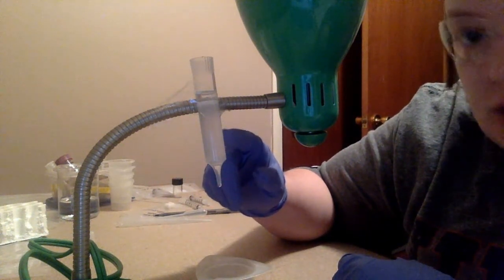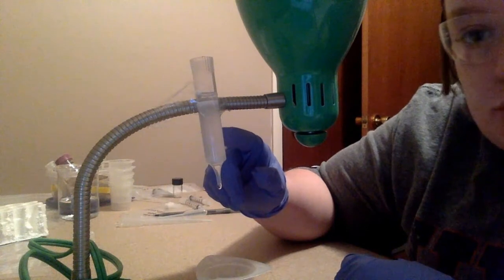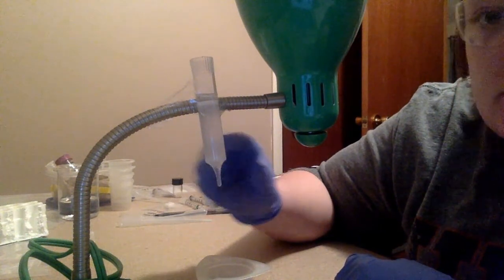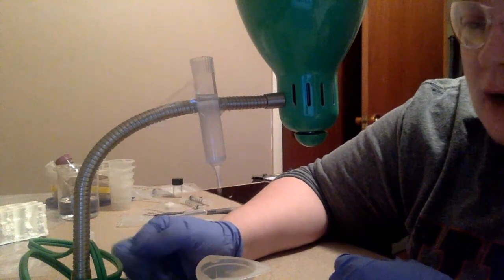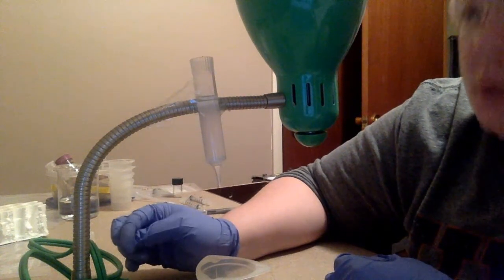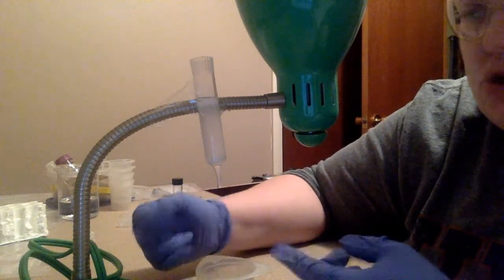It almost looks like a gel, but the beads look similar to a wiffle ball in PE with lots of little holes in it. When we put our unknown sample in here, the larger molecules are going to navigate around the beads because they can't fit in the small holes that the beads have. But the smaller items are going to navigate through the holes in the beads from one bead to another.